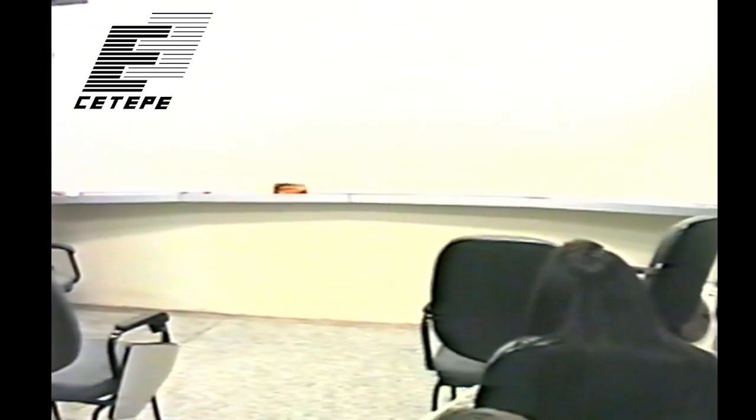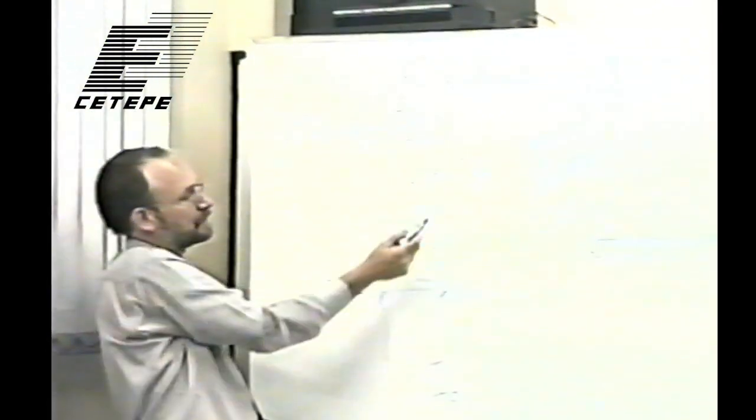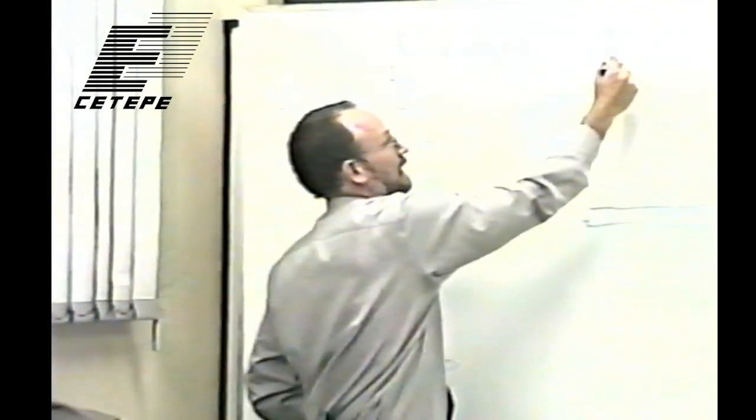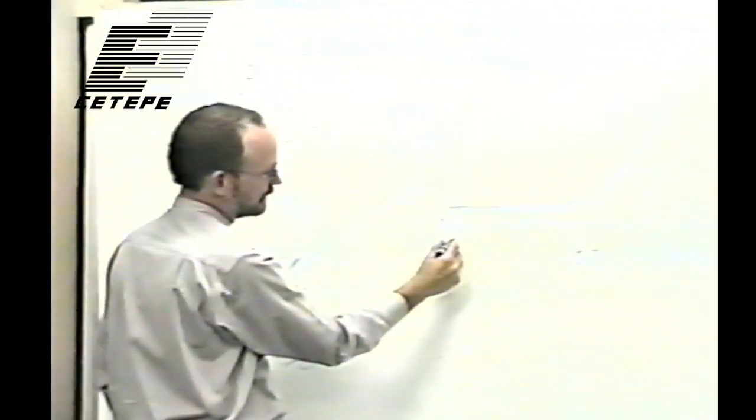I think I had this backwards, I had this upside down, because if less light comes through, the optical density is bigger. So the less light that comes through, the bigger the optical density, because this is black. And this here is totally translucent.